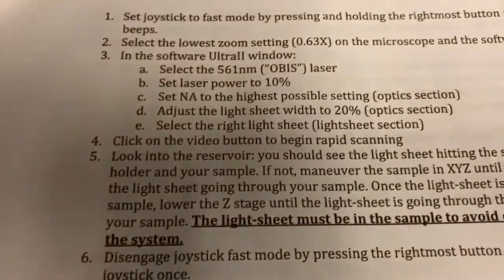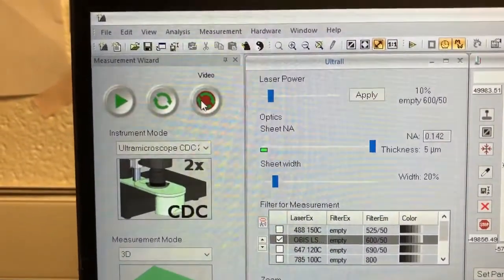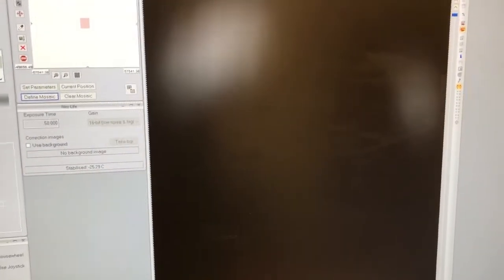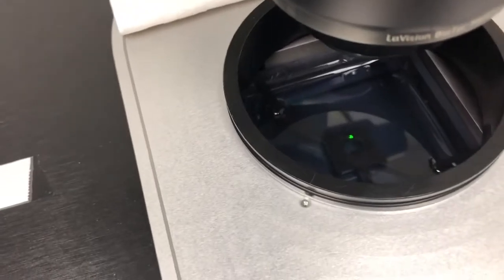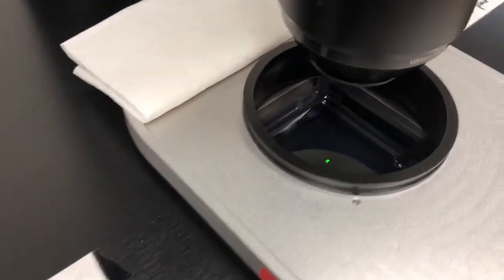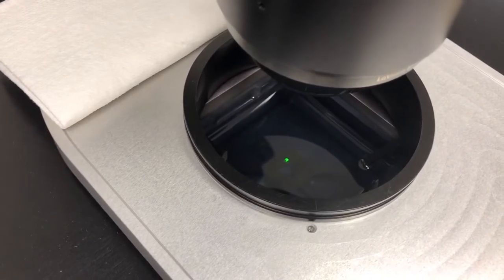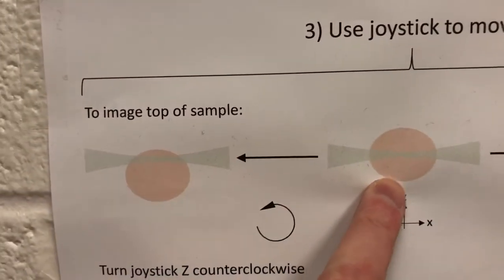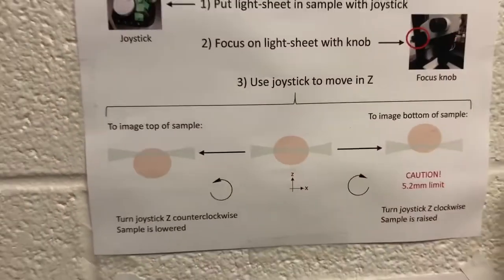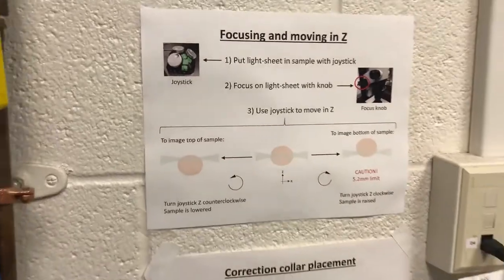Step four is to click on the video button to begin rapid scanning. If you click on this, you'll hear a noise. You typically won't see anything on the screen — don't worry about that. What we now need to do is look into the reservoir and see what's going on in there. This is absolutely critical: before we do anything else, we need to confirm that the light sheet is physically in the sample. We can only confirm that by eye.